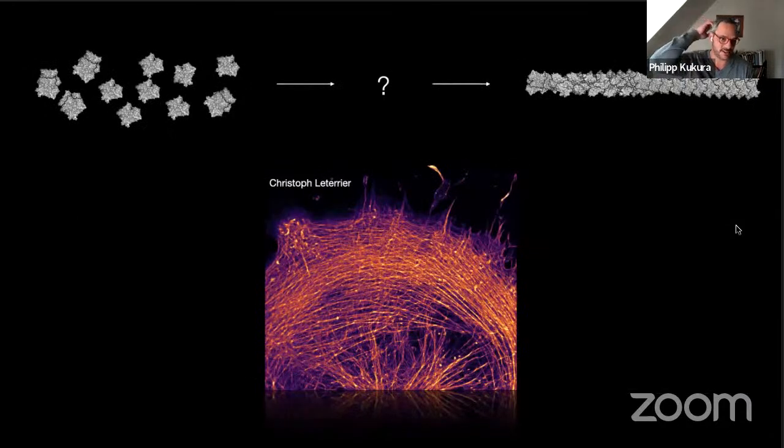just with one more story, and that is unpublished, but I think that's okay, where we try to look at actin. It's fundamentally a fairly simple question, right? You have proteins in solution, soluble, and there might be some monomers and dimers, and then something happens and it turns into a filament. And then something happens and it goes back. And of course, this is an essential process for a lot of cellular function. Actin is only one example of many proteins that form filaments and fall apart, or form extended structures and fall apart. And so the question is, how does this work? What's the mechanism by which you go from left to right and back?